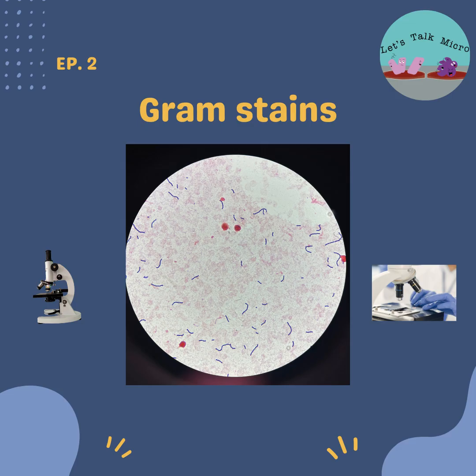It is great. It starts providing a picture of what you have in your sample. Keep in mind that what you have in your gram stain should always correlate with what grows on your agar, but that's not always the case. Sometimes the organisms are not viable. You might have poor technique from the person setting up the sample. Sometimes you might have a low organism amount, and you only see it growing once it's on the agar, and you might not see it on the initial gram stain. And those of you that work in microbiology, you know this.